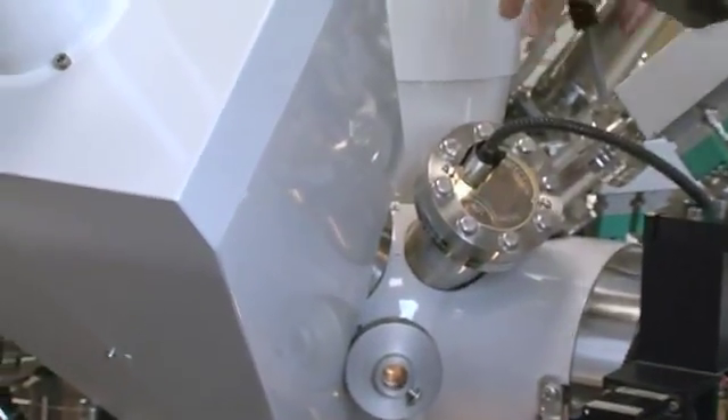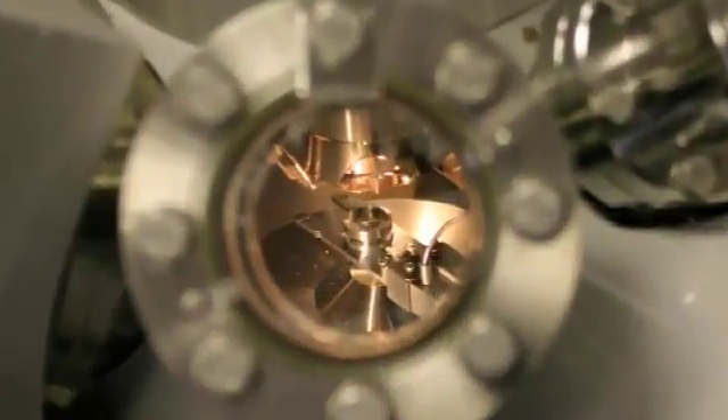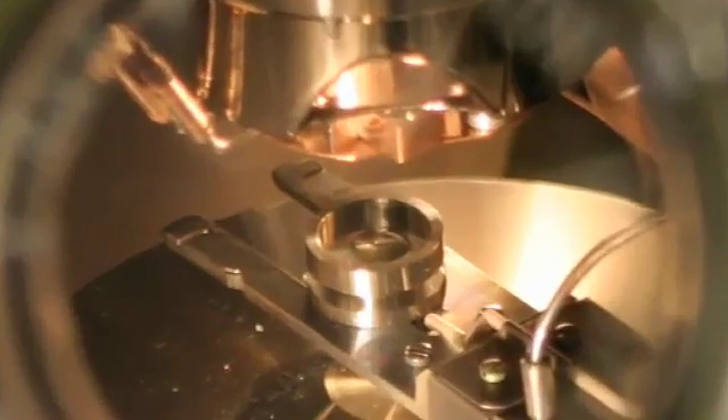We've come downstairs now in the school of chemistry, and this is the XPS room. We have to put a sample inside — XPS uses high vacuum, so you can hear the pumps sucking out all that atmosphere and air. The sample goes right in the middle of this central chamber. Traditionally you could only put solids in this type of machine, but my group was one of the first in the world to put liquids in without having to modify all of the instrumentation.